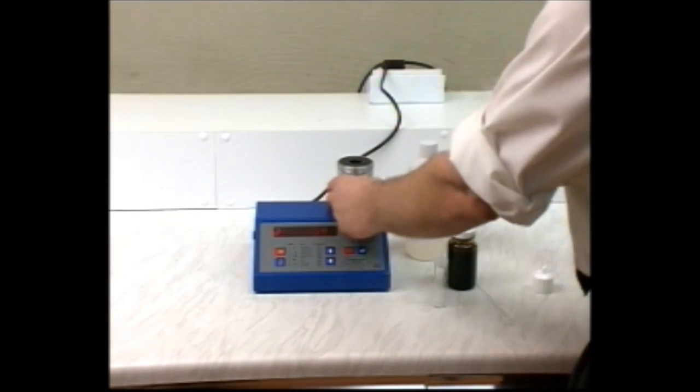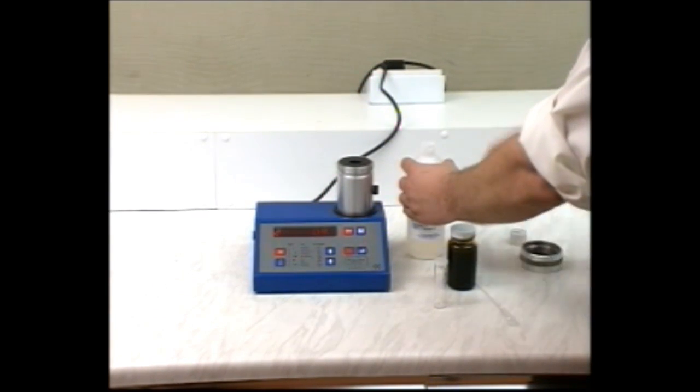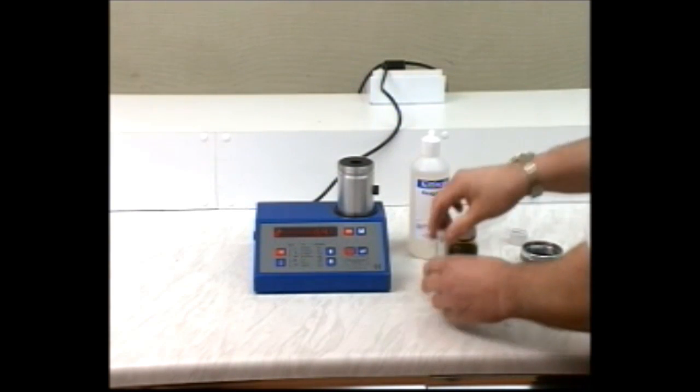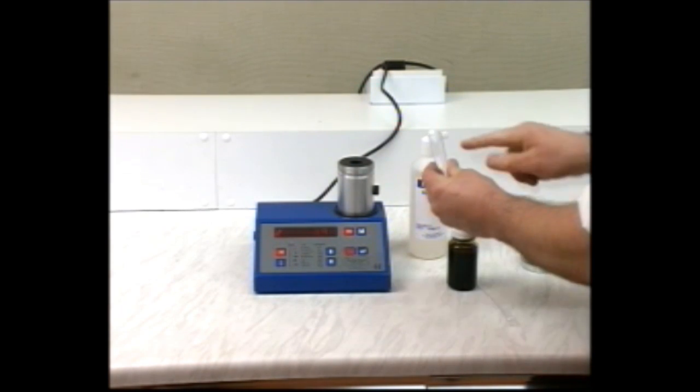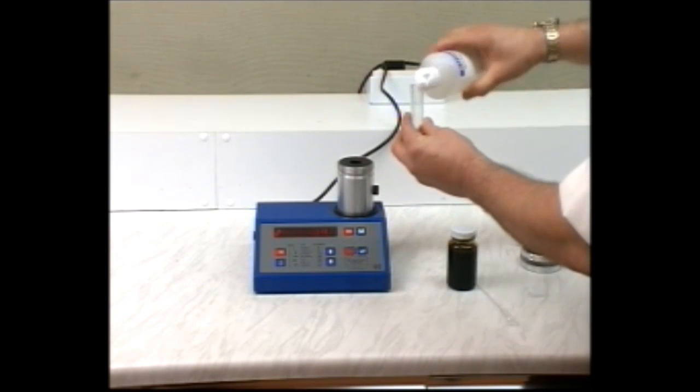Place the cell on the unit. Fill the insolubles tube to the fill line with reagent J, and place it gently into the cell.